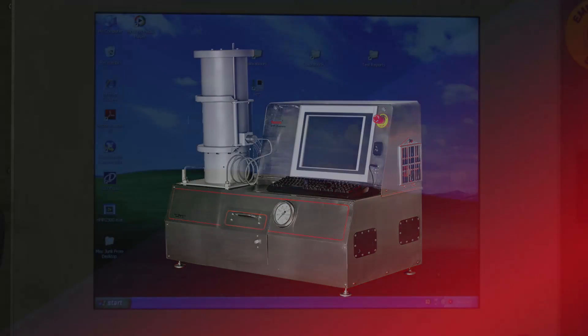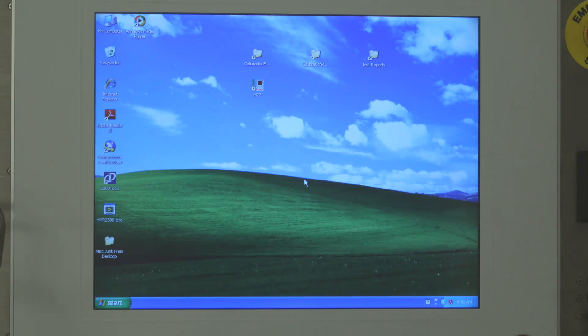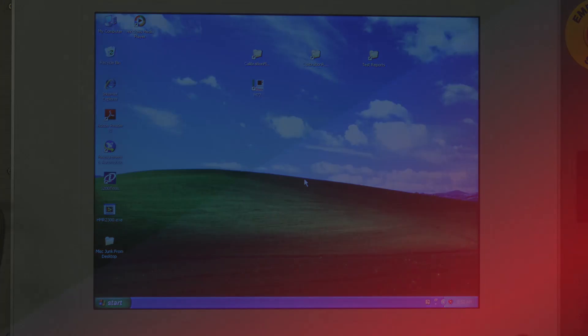A Microsoft Windows computer is integrated into the rheometer. Test progress can be viewed at any time on the integrated touch screen.